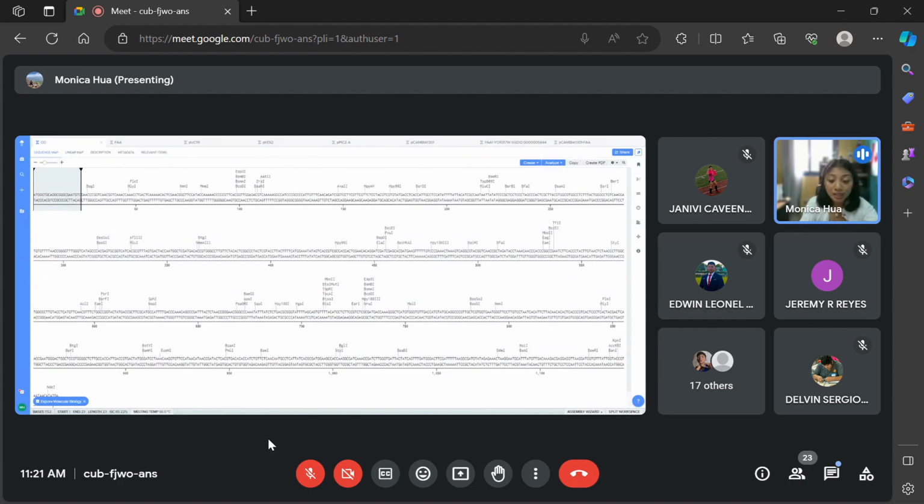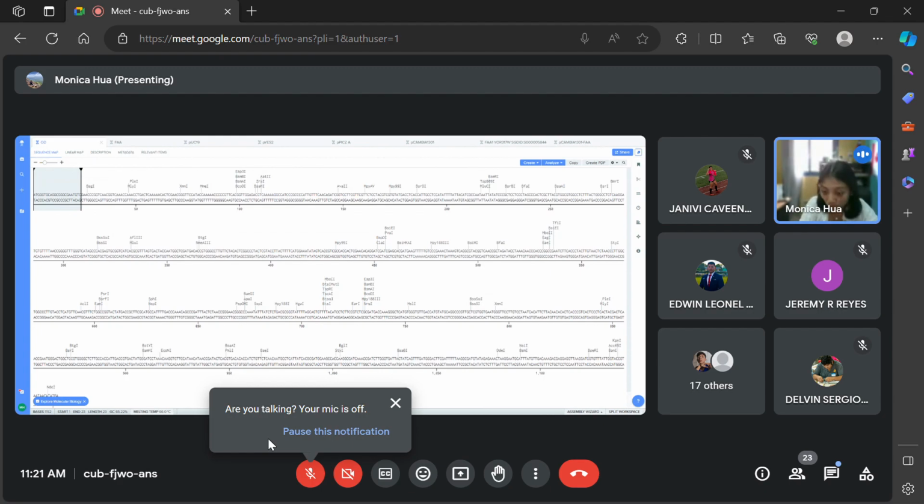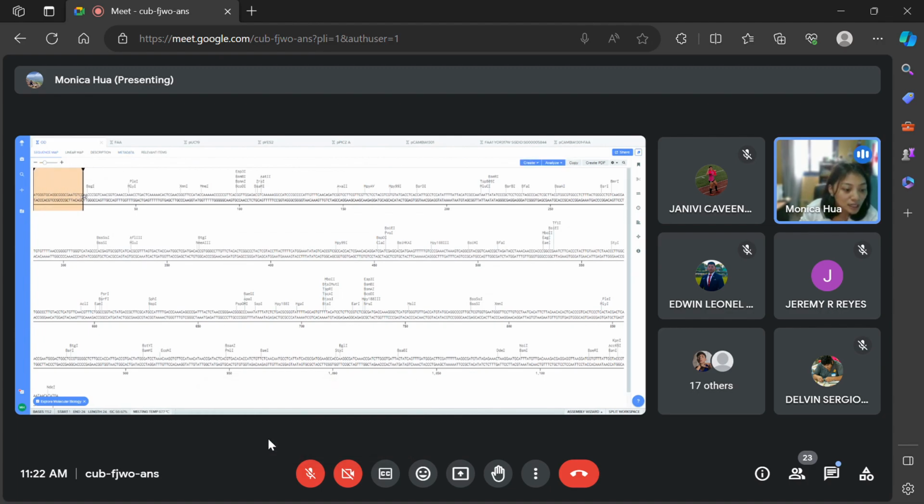Okay, so you select the first 20 nucleotides. I'm going to use your old OD without the restriction enzyme site as an example. So I'm going to select 20. At the bottom, you can see there are some numbers. It starts at 1, ends at 24. Basically the length, just how many you selected. So I selected 24. I'm going to select just until it reaches 20, there you go. So I'm going to select 20.